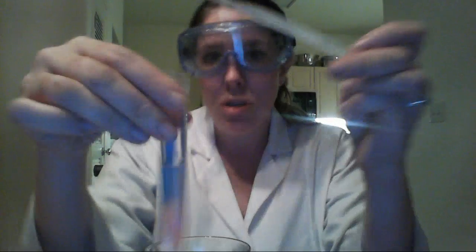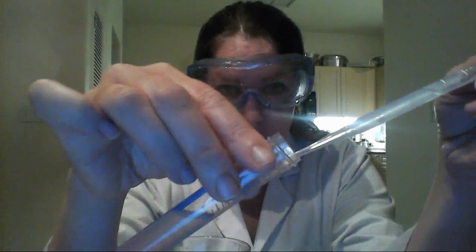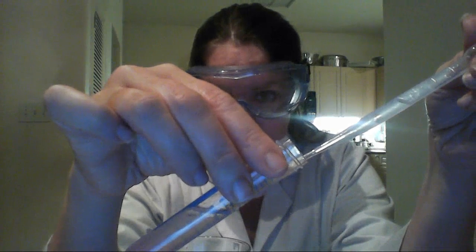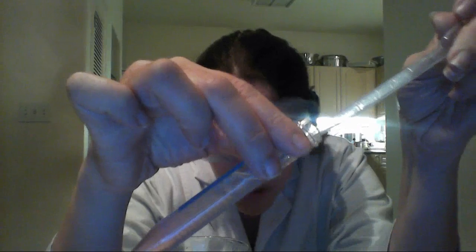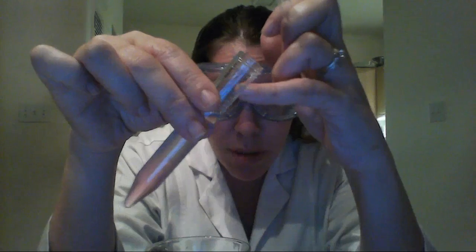Now I'm going to take my tube, hold it at a 45-degree angle, and just very slowly drizzle it down. And what you'll see is that the ethanol will stay on the surface. It's less dense. It'll stay on the surface. And just keep doing it down there. You may right away start to see some DNA threads. Okay, there's one.